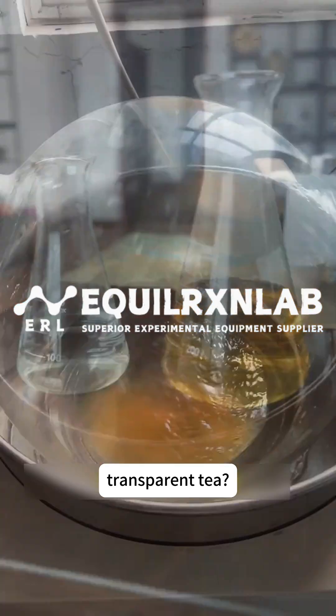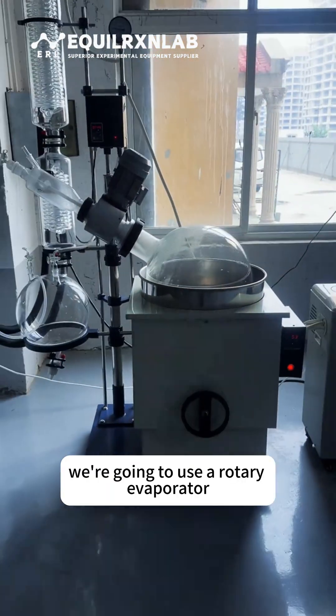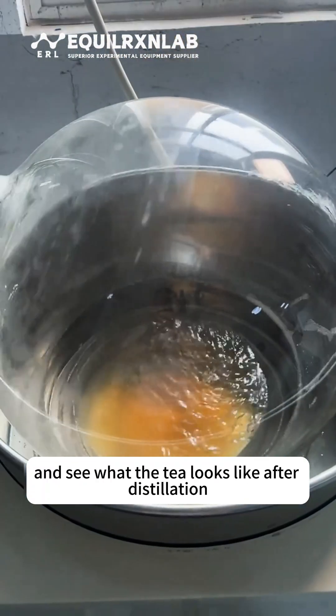Have you ever tasted colorless, transparent tea? Do you know what tea tastes like after being distilled? Today we're going to use a rotary evaporator to distill jasmine tea and see what the tea looks like after distillation.